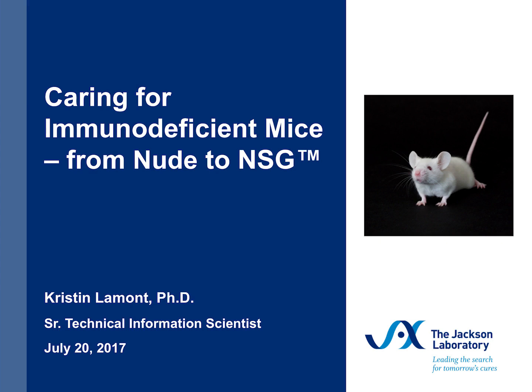So they're fantastic models, but they're super sensitive to traditional pathogens, opportunists, and organisms that are not typically pathogenic in mice. And so, how does that affect how you care for them and how you breed them and what their husbandry is? So this presentation is going to be more focused on the practical side of working with these mice, and I hope that it'll be really valuable to you.